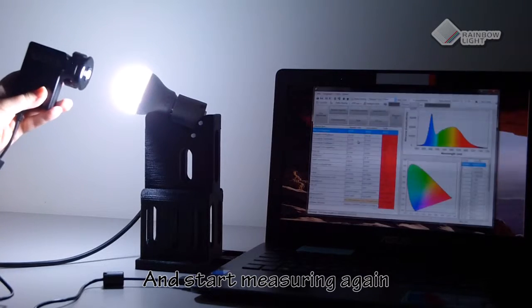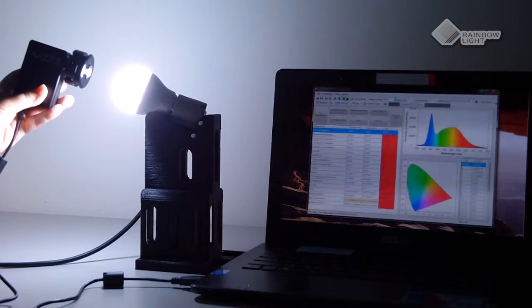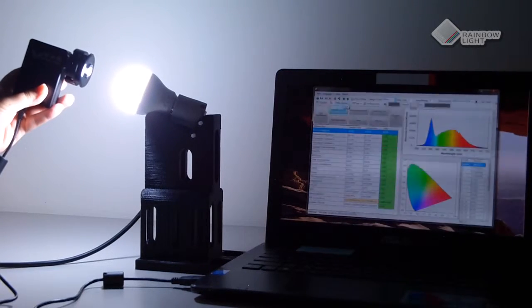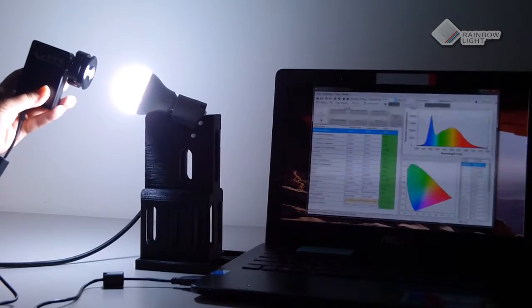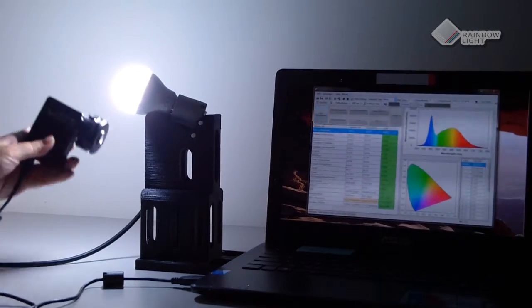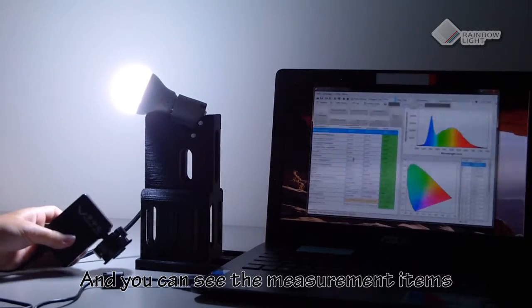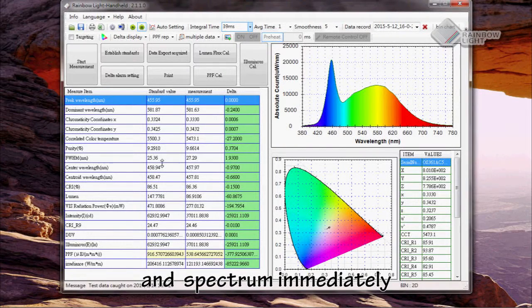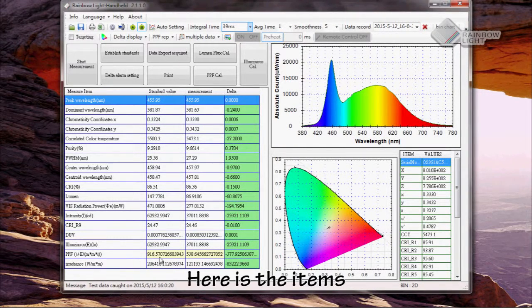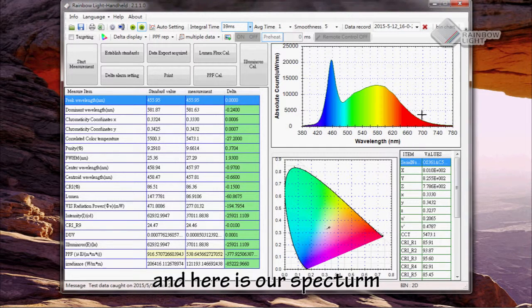Start measuring again. Then you can see the measurement items and spectrum immediately. Here are the items and here is our spectrum.